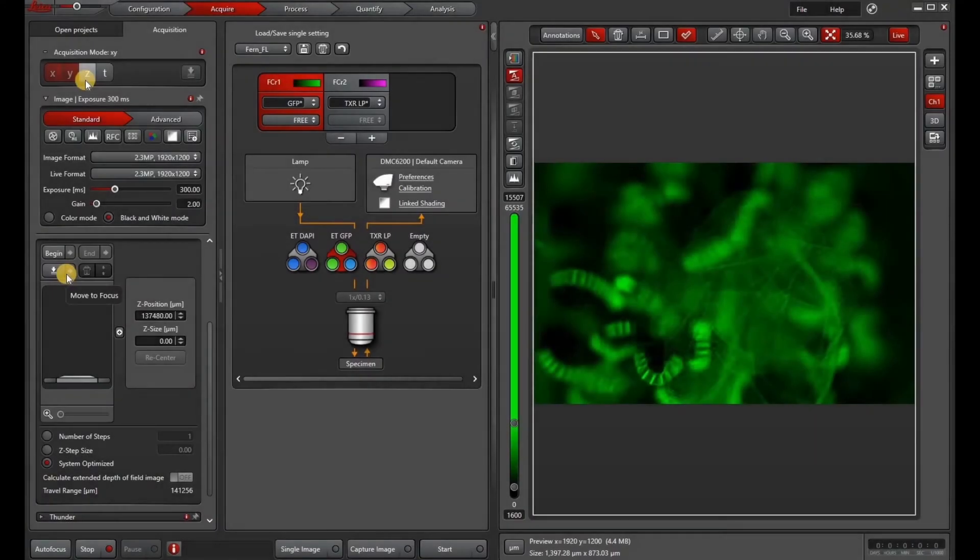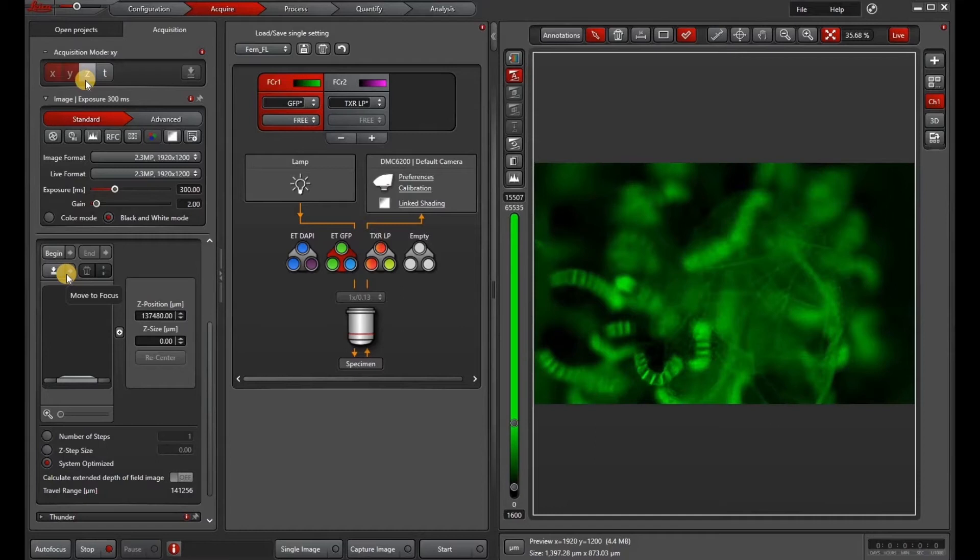In this video, I will go over how to do z-stacks on a stereo microscope and also go over how to do an extended depth of field, parallax correction, and maximum intensity projection. These will also be applicable to other microscopes in LASX.